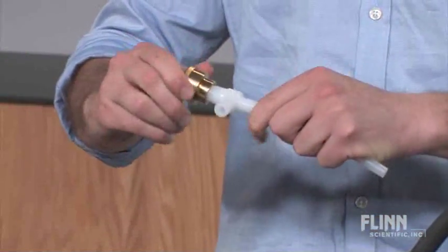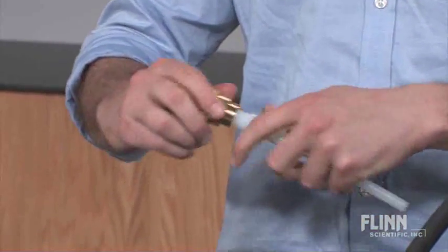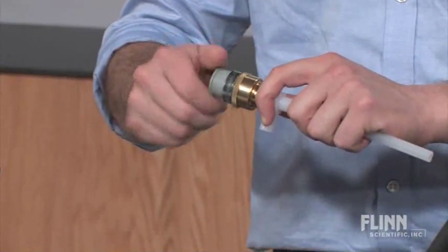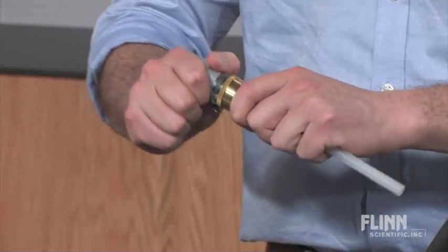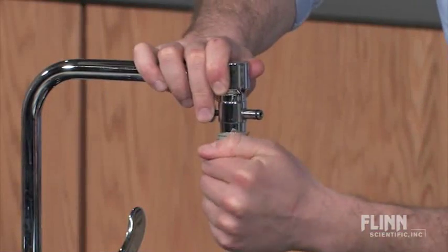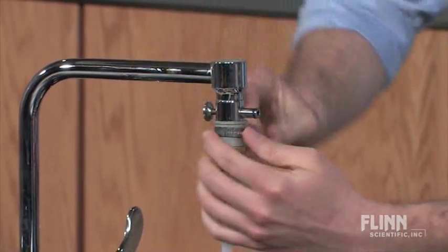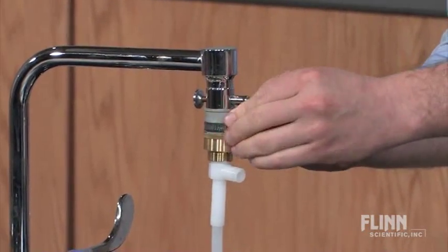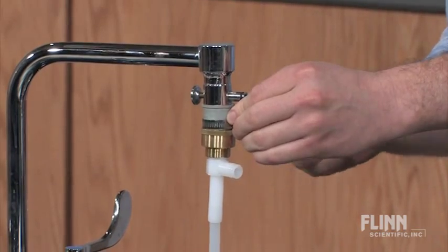Attach the water aspirator directly to a laboratory faucet. If the aspirator does not fit easily, use a female coupling and universal adapter to attach it securely. The universal adapter will fit virtually any faucet by tightening with a flathead screwdriver. For an extra tight seal, you can wrap the faucet and adapter threads with Teflon tape.